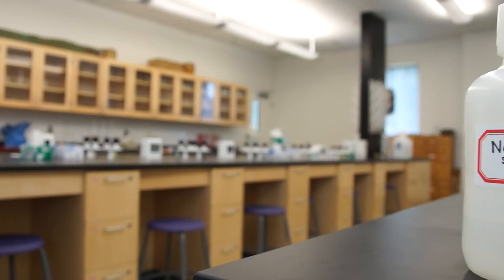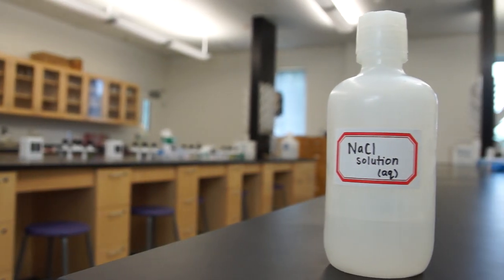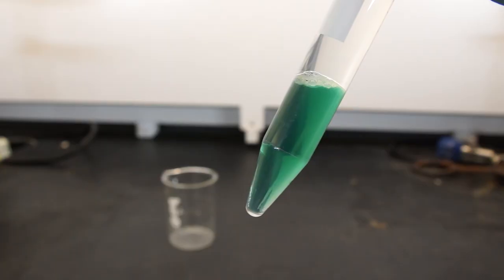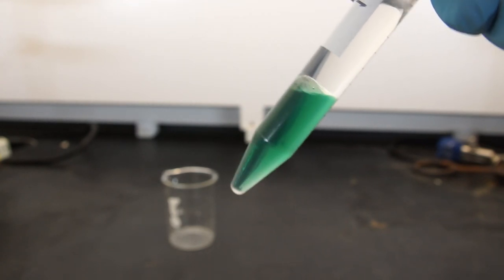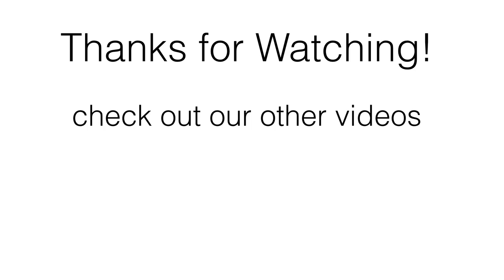Make quick, fast swirls of the tube. You could also try adding some sodium chloride solution. You want to make sure your emulsion is cleared up before you try separating the layers.